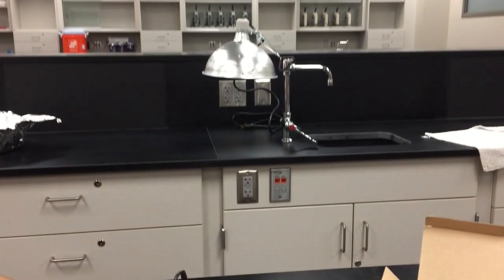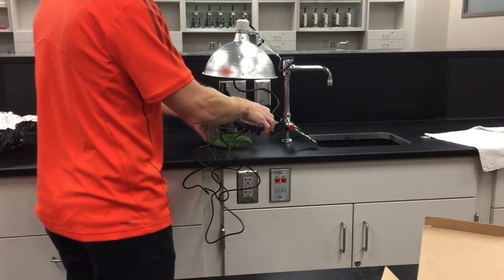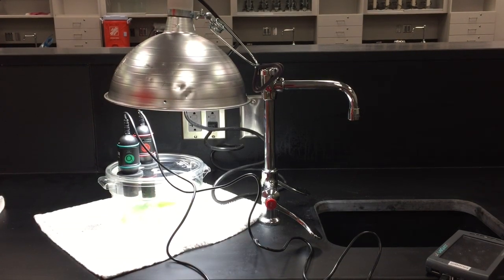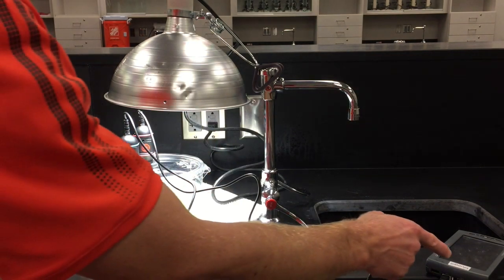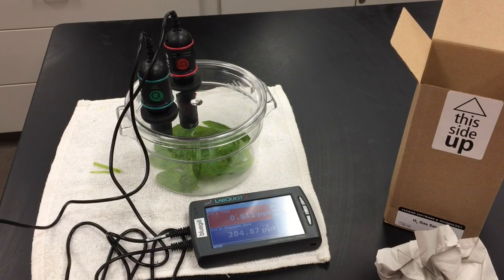Set this up in the light. Once you have everything set up, go ahead and turn the light bulb on and wait five minutes for the gas exchange to start occurring. Once five minutes is up, hit play on your LabQuest. In the lab, you'll probably end up partnering with another group because you won't have time to run this both in the light and in the dark. So one group runs it in the light and the adjacent table runs it in the dark, and you compare and share your results.